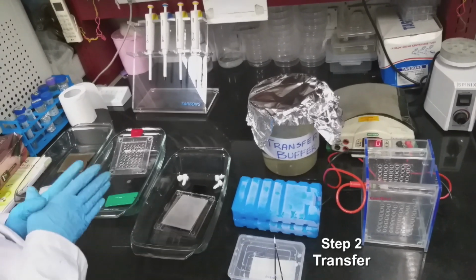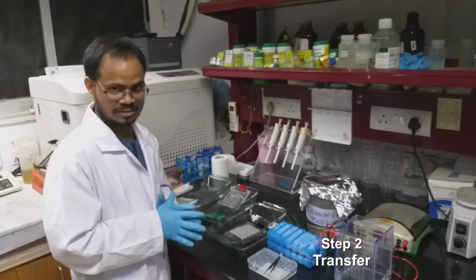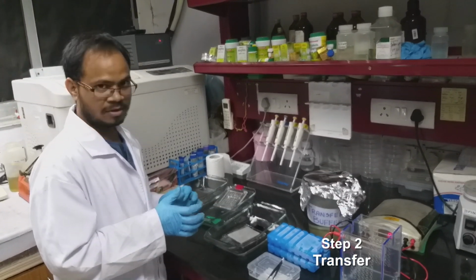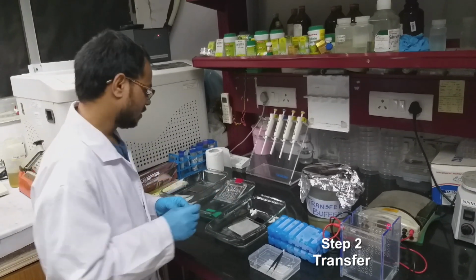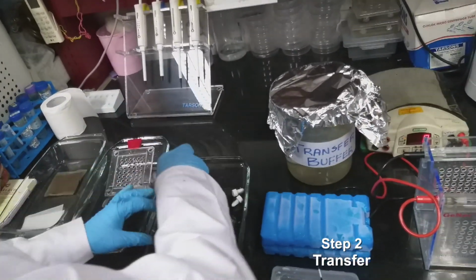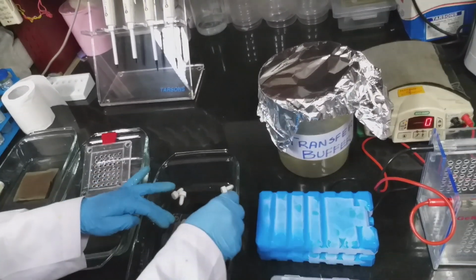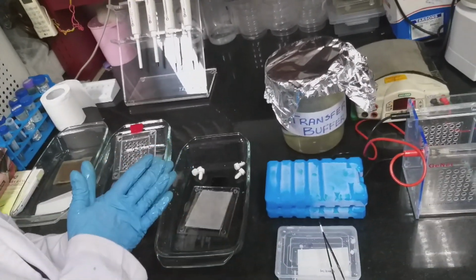Here we have to remember that after finishing the SDS-PAGE running, you have to keep the gel in transfer buffer, so that it gives identical conditions, an equilibration of sorts, during transfer, so that protein transfer may be easy. So this is the gel, keeping it on the negative side. After that we have to overlay it with the membrane.